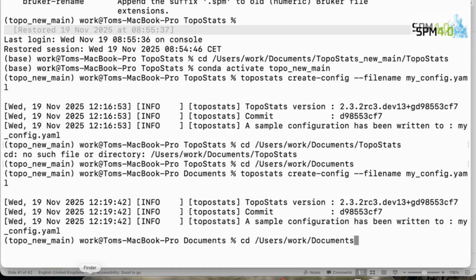in the input directory, here's the start of that. Do that line first, and then do that line.